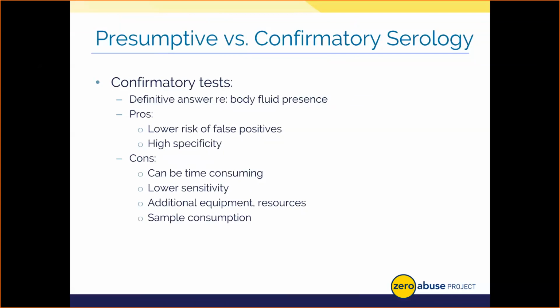If we have a positive result from a presumptive test, assuming we have plenty of sample to run the gamut of body fluid tests, that is, we will engage in a confirmatory test whenever possible. Note that some body fluids do not have confirmatory tests available. As the name indicates, these tests simply verify the presence of a body fluid or tissue. Confirmatory tests have a lower risk of false positives and are very specific for a given body fluid target, making them an ideal follow-up for homing in on what body fluids you're dealing with on a given item.